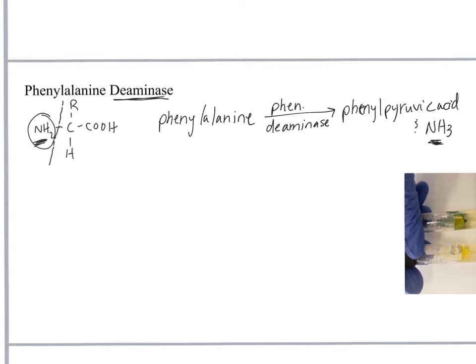So to inoculate, the phenylalanine deaminase tubes are just a slant that's been enriched with phenylalanine. So remember, when you inoculate the slant, you're just going to loop your cells on the surface of the slant. We're going to incubate it, and when you come in next time, we're going to add 5 drops of the reagent ferric chloride. And you don't have to do that aseptically. When you come in, you can go ahead and add those drops right in the top. That ferric chloride is kind of yellow.